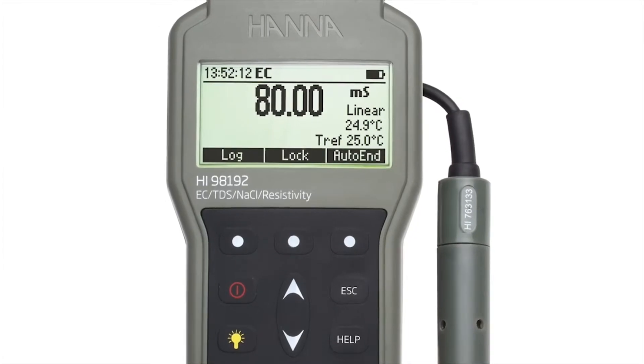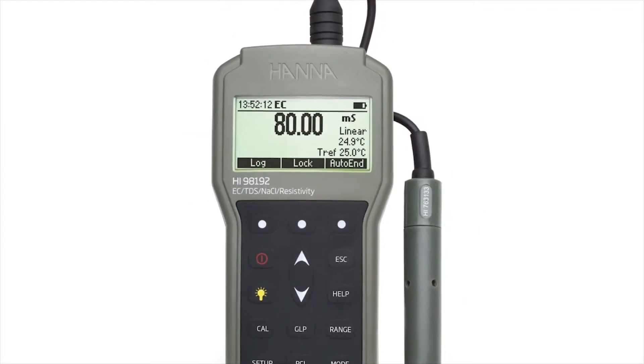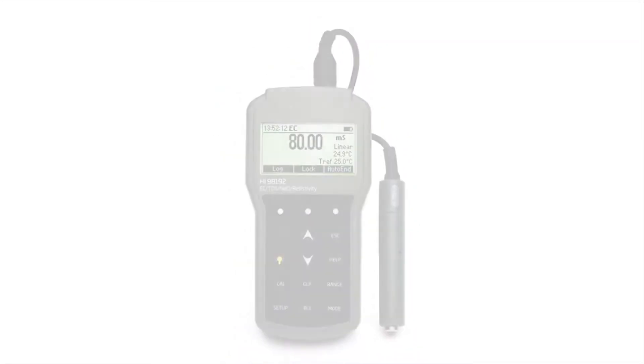The HI-98192 is part of Hanna Instruments' line of portable meters which measures conductivity, total dissolved solids, salinity, and resistivity.